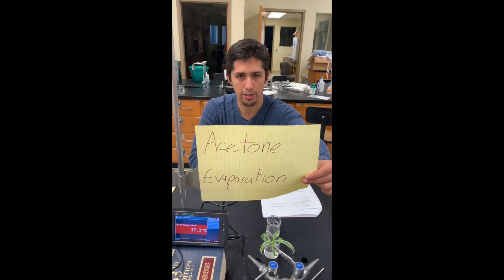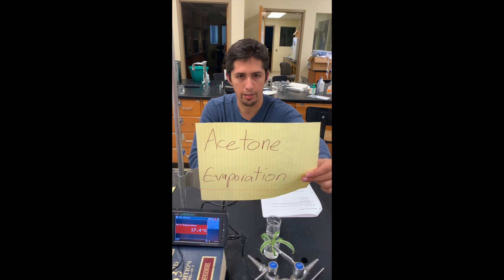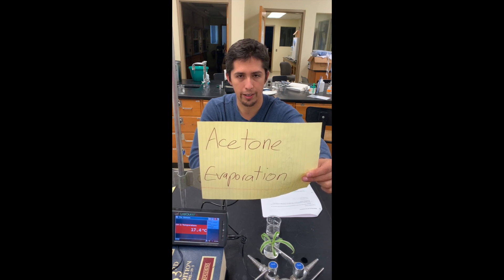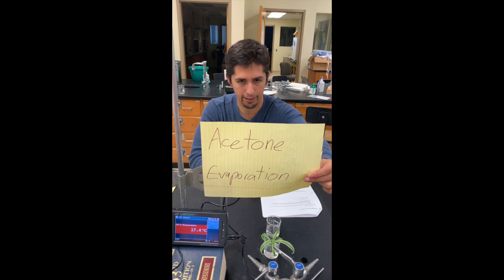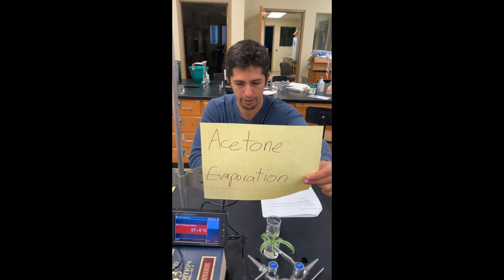For this next demonstration, we will be observing the temperature change when acetone evaporates from a temperature probe and determine the thermodynamic properties.